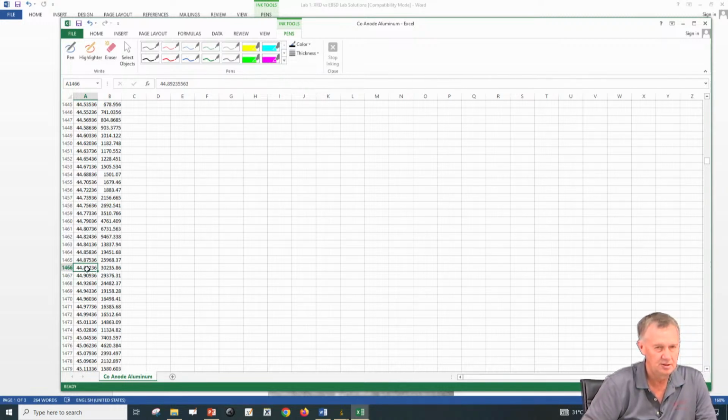From the angle we are calculating d. From the X-ray data, yes, this is the peak, at the angle at which we get the peak. There. Right. So this is the peak that we're looking at.